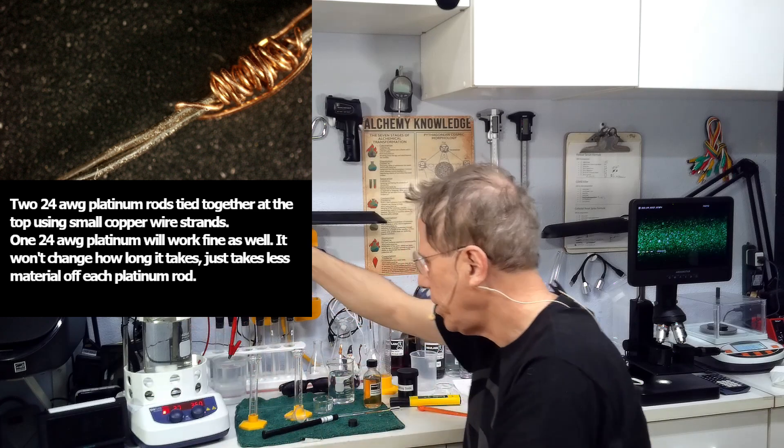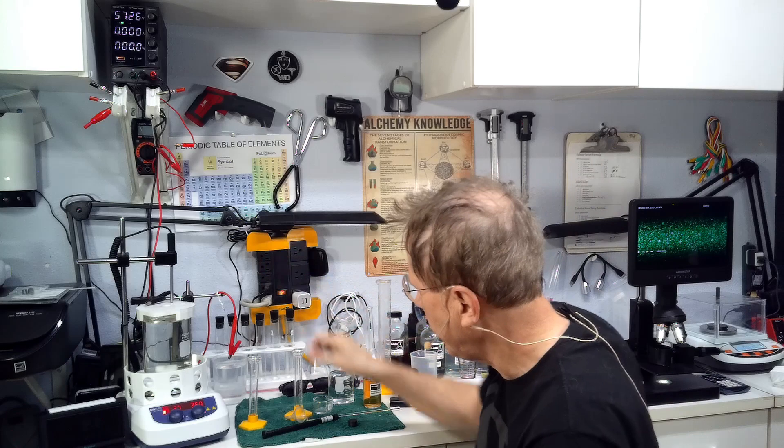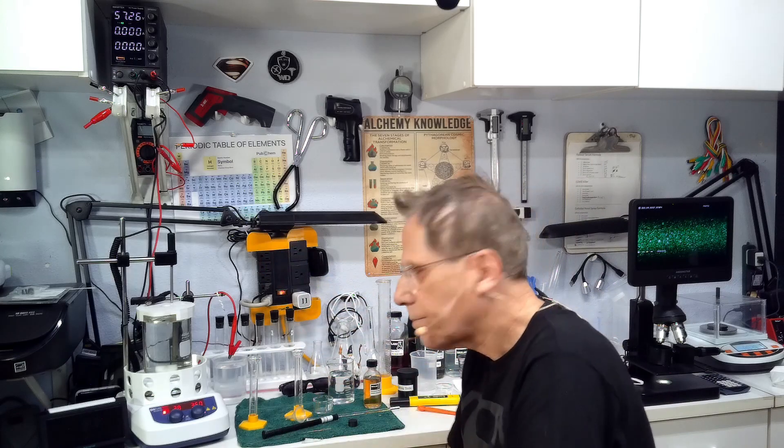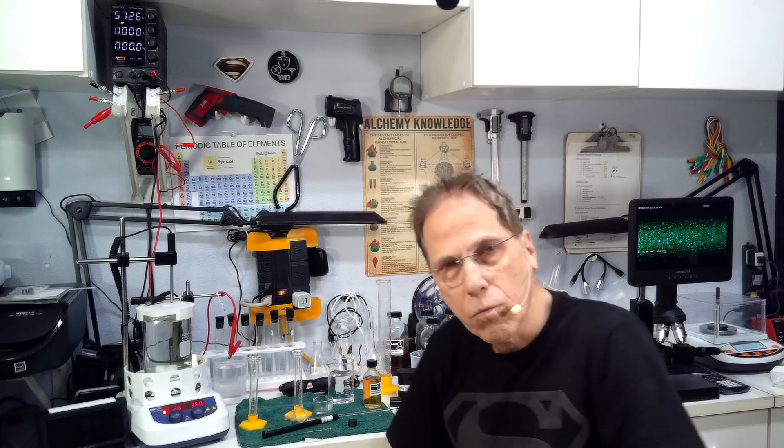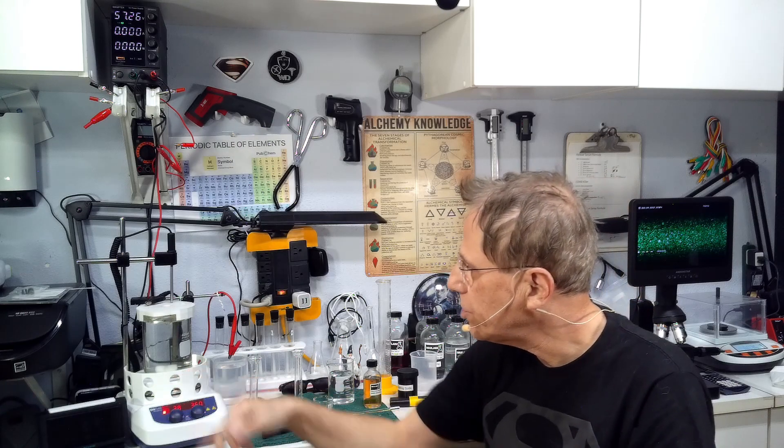The process is going to take about five to eight hours. I'm hoping with the 24 gauge platinum rods, I got them twisted together at the top. I want to do a weight on these first before I put them in there. I will be back as soon as this temperature reaches over 70 degrees C.